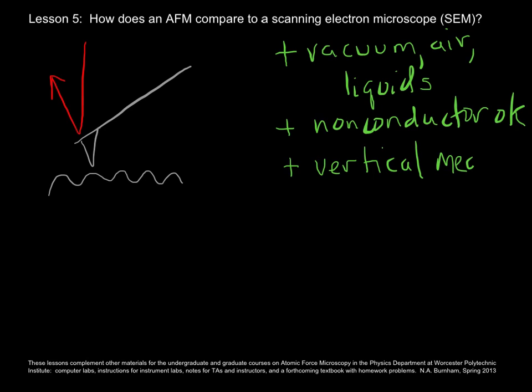Right, so you can get the features' height in an AFM. And then, because you don't have to be a conductor, the sample prep is easy.